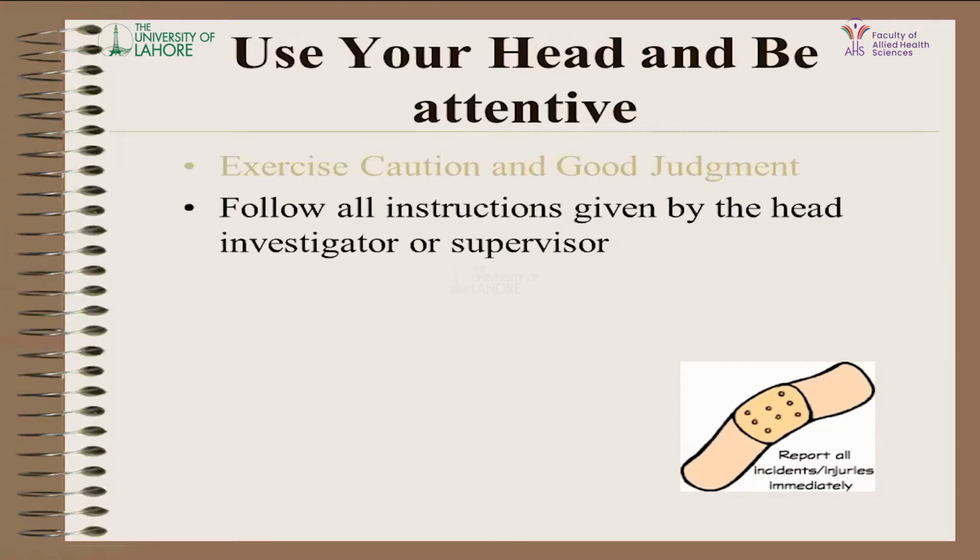So that's why it is very important that we follow each and every step that is mentioned in the standard operating procedures and all the activities that we are doing in the laboratory. First of all, as you know, we have to be attentive in the lab. Each and everyone working in the clinical laboratory or any research laboratory should be attentive and should use their own judgment in order to prevent any harm or any incident that could lead to their exposure to such organisms. Exercise caution and good judgment.